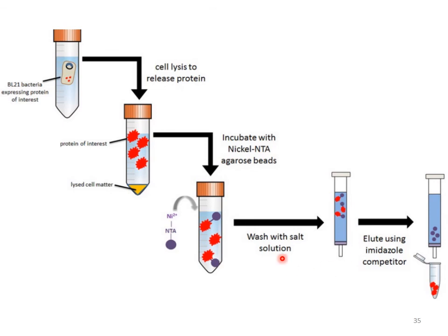In this manner, all other impurities could be removed in a single step of chromatography. So affinity chromatography is quite useful because it results in producing high yields and with greater efficacy of purification.